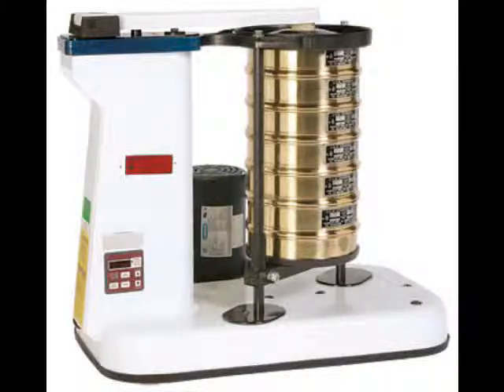Howdy! Brandon Deshaw here, Lab Director, Global Energy Labs. Let's talk about whether or not you may have frac sand. This is episode one, frac sand size. And the way that we're going to determine the size of your sand is by doing what's called a sieve analysis.